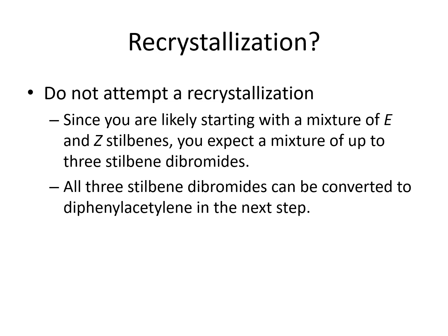Recrystallization, again, as you may remember from your previous organic chemistry laboratories, this technique is used to purify a contaminated solid compound.